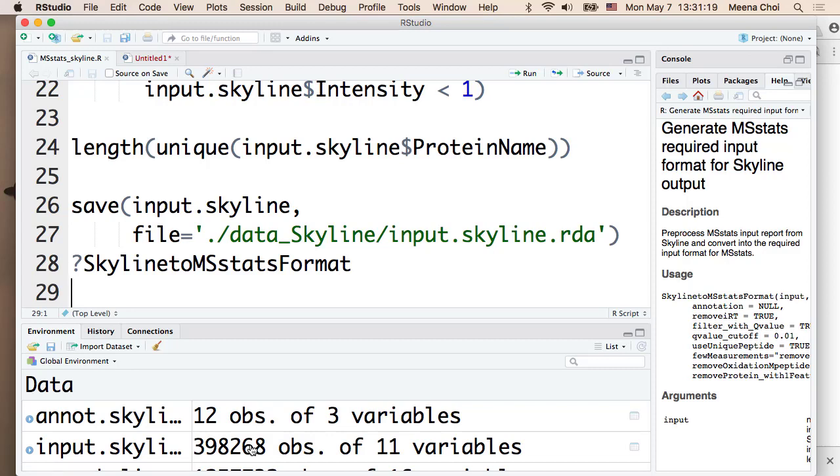What I'm worried about is the OpenMS converter. That is quite new, so it will only be available in 3.12. So I recommend upgrading to R version 3.5. And if you have an issue with that, please let us know. The TAs will try to help you install that part.